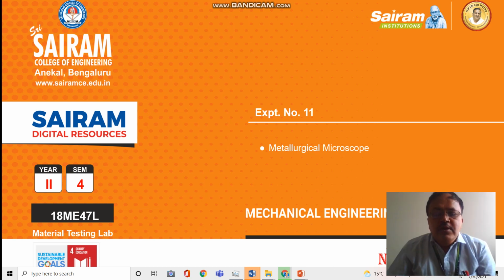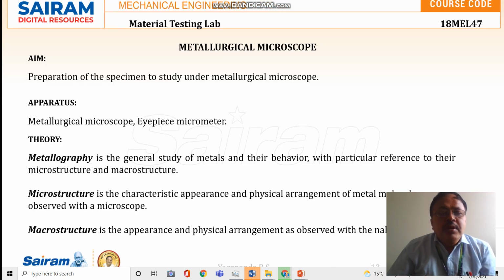Good morning, friends. Now we are discussing metallurgical microscope demonstration in the material testing lab. So, the aim of the experiment is to prepare the specimen to study under the metallurgical microscope. Apparatus: metallurgical microscope and eyepiece micrometer.